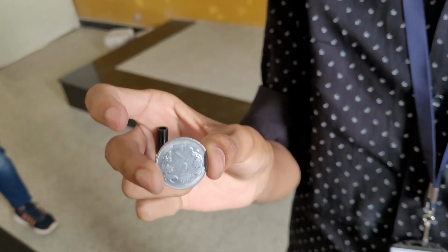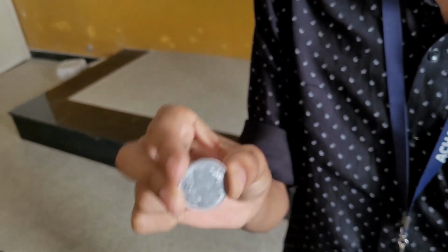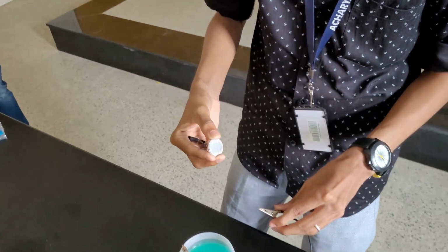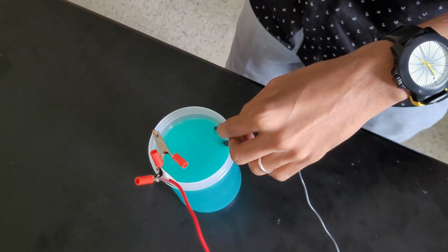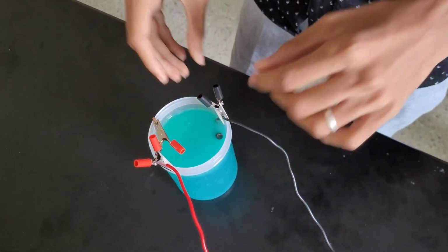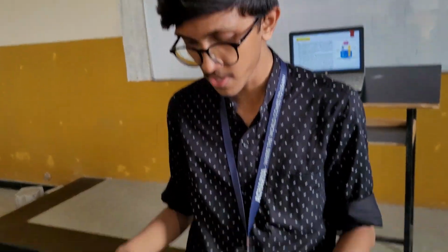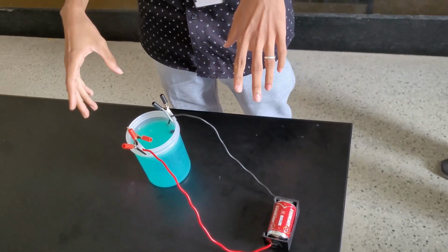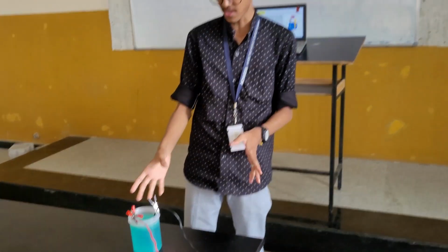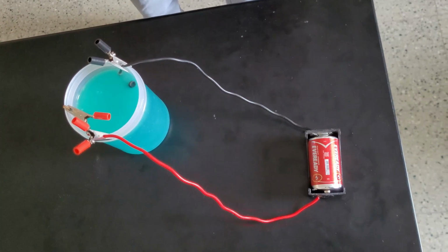This is the coin that we will be electroplating with copper. This is how it looks before electroplating, and I will show you how it looks after electroplating. This is connected to the negative terminal of the battery and inserted inside the electrolyte. One important point to note while electroplating is that the anode and the cathode should not touch each other, because when they touch, the electric current will pass through that only. So they should not touch during the electroplating process. As you can see, the electroplating process has started, but this will take a little bit of time. While this process is going on, my friend Prashant will explain the working of electroplating.